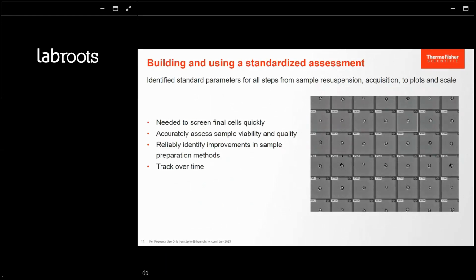So I ended up needing a standardized assessment method, and returning back to the tissue that we've been discussing, I had to approach it from a different angle, since variation was an inherent feature of the samples I'm working with, the mouse whole lung homogenate. I needed to compare data from a series of single cell suspensions.